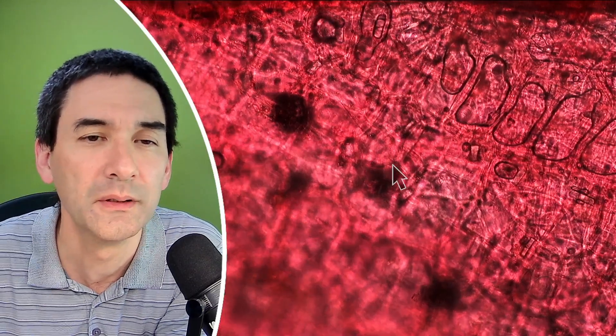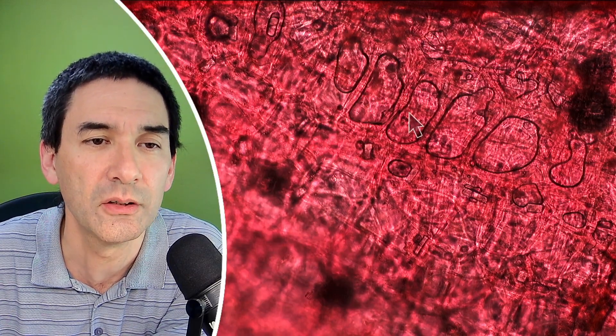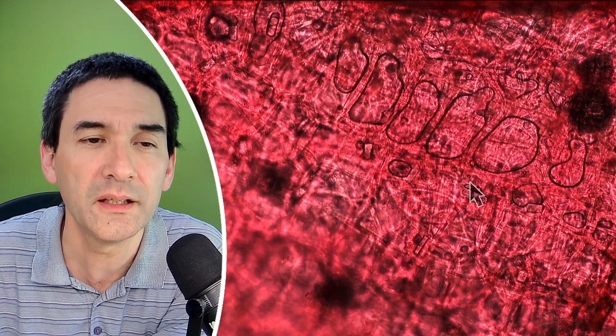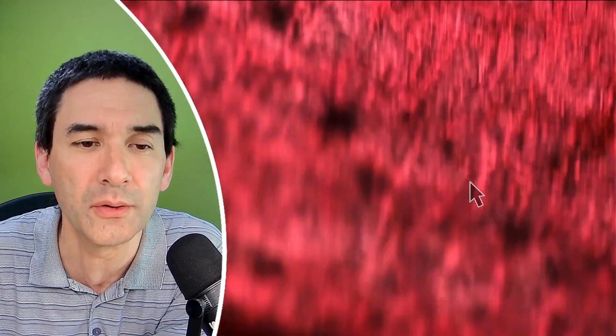Let's go back to the water and have a look again. Here, for example, here we can see quite nicely. That's air everywhere here. And it also does not quite look as transparent. So, I think this also has to do something, not only I think, I'm quite certain that this also has to do something a little bit with the refractive index.